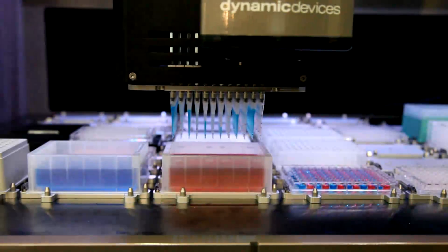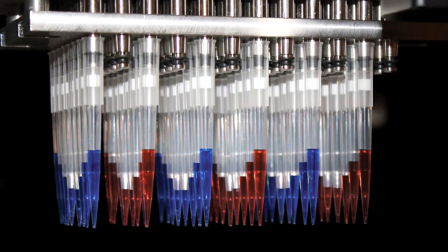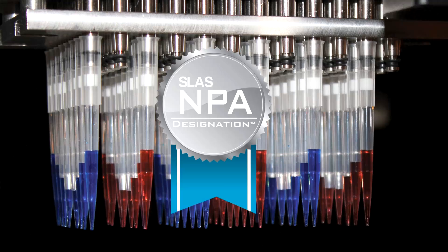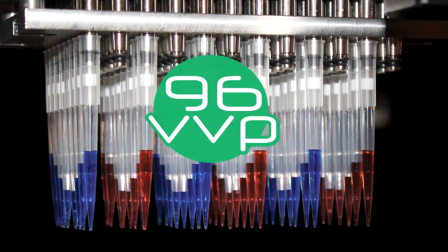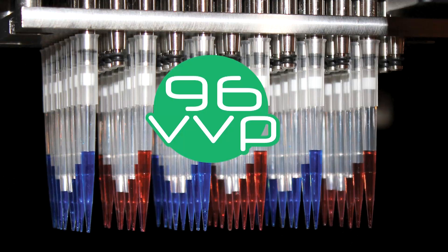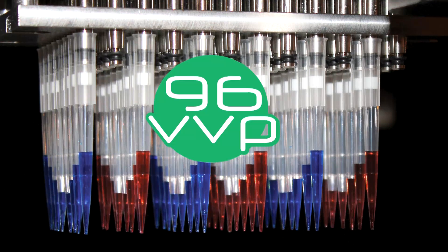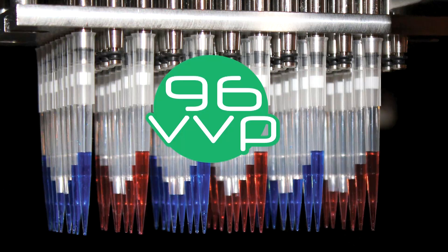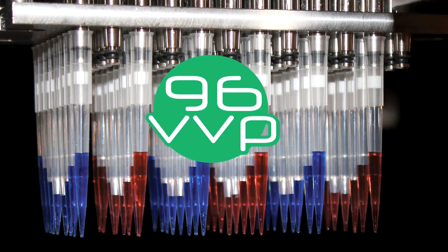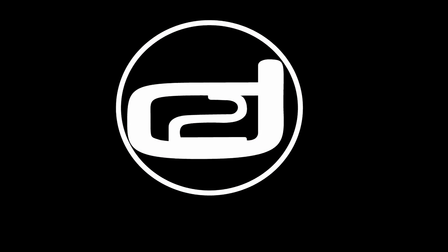The 96 VVP head with volume verified pipetting — the winner of the new product award for the SLAS 2012 trade show. 96 individual volumes, volumetric liquid transfers, individual clot and clog detection and correction, error-based pipetting technology, and an easy to use platform. The 96 VVP head by Dynamic Devices.